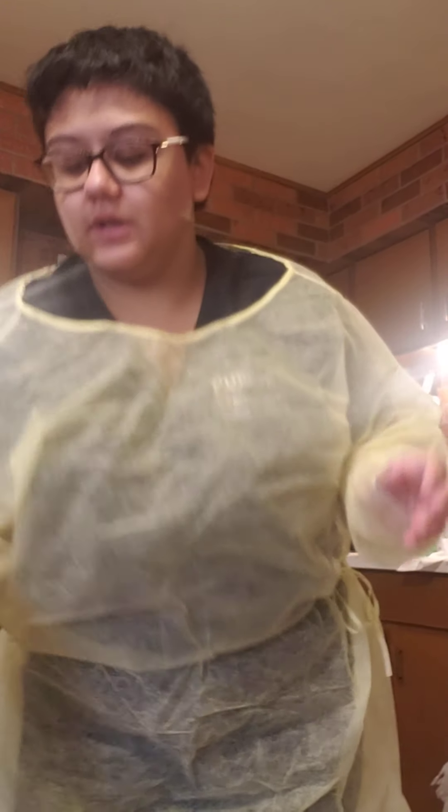My gown is on. Next I'm going to be putting on my face mask.